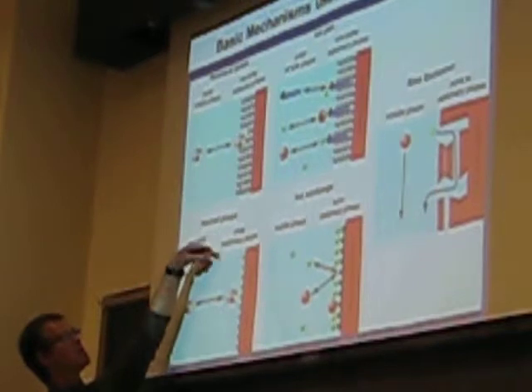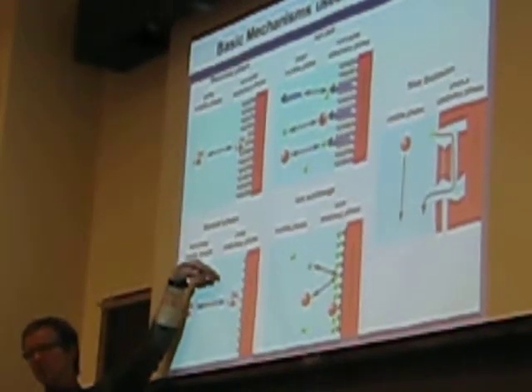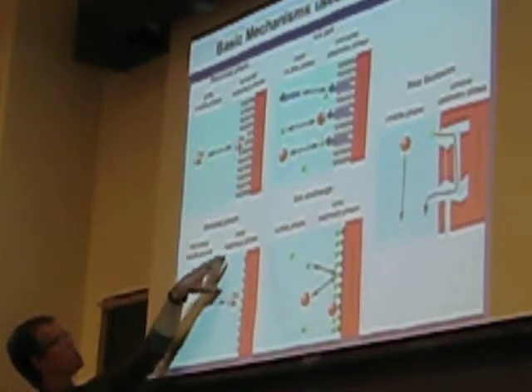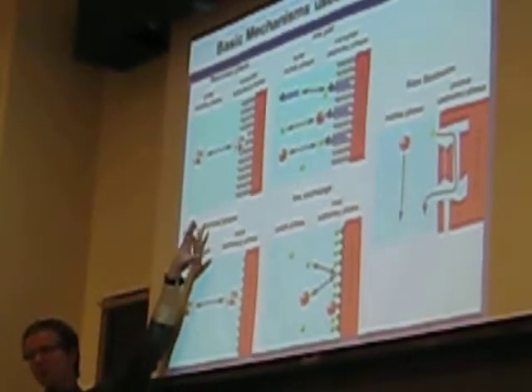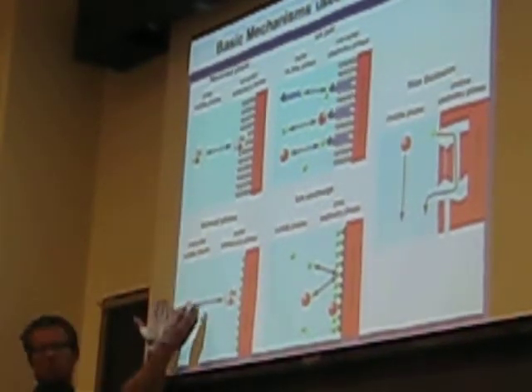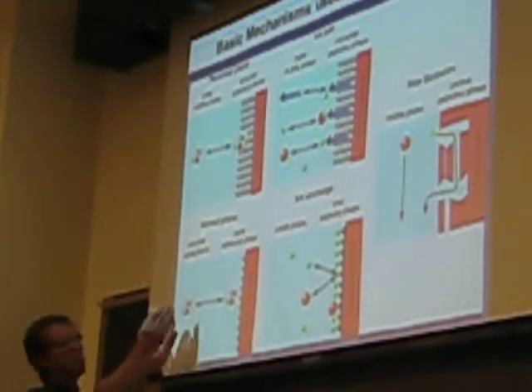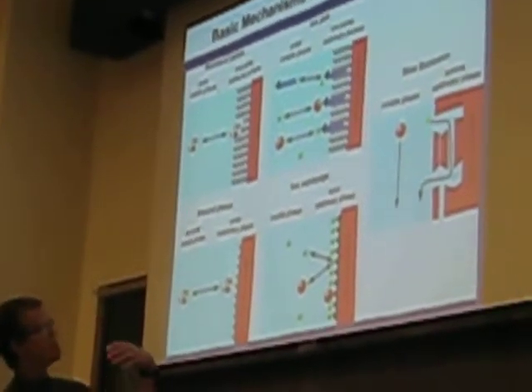But you do that because the composition of your mobile phase is different. Sometimes people will use either normal phase or reverse phase for the same kind of molecules, but it's the composition of the mobile phase, which of course is opposite what the stationary phase is, that really helps to drive that selective partitioning.